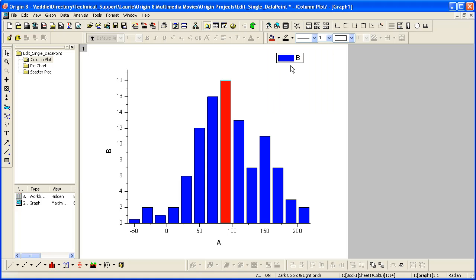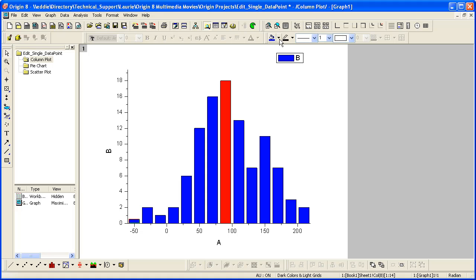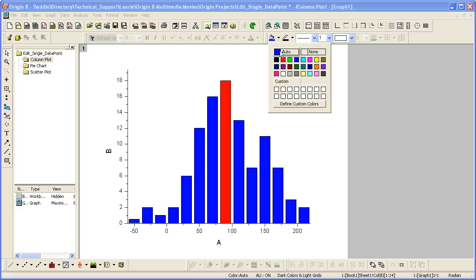Use the style toolbar to change it to red. I can continue using this control click method to change the color of any of the columns.